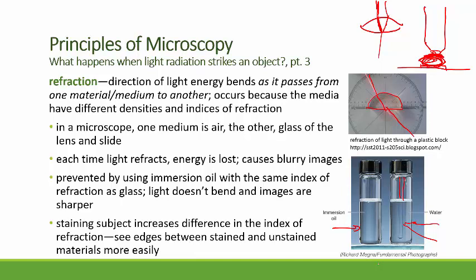And so refraction can be of use because it helps us to show up those edges in the same way that here refraction has helped us to see the edges of the glass rod. But there is a cost to that refraction, and that is a little bit of blurriness ensues. So working at the kinds of magnifications that we're working with, up to about 1000x, the trade-off is still good enough that the resolution that we can achieve makes it possible to overcome this energy loss because of refraction. Okay, so refraction can occur.